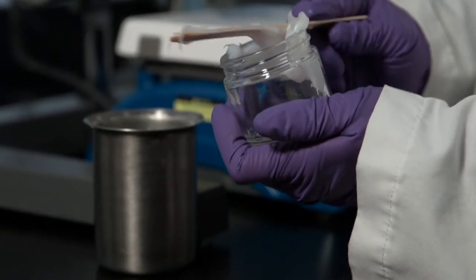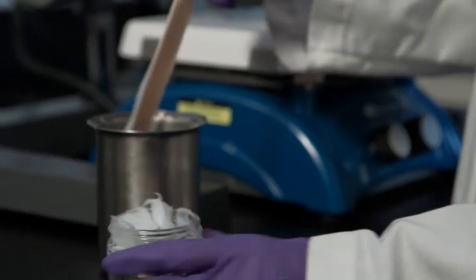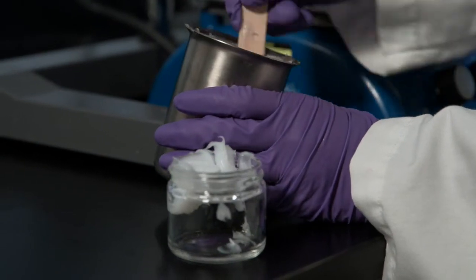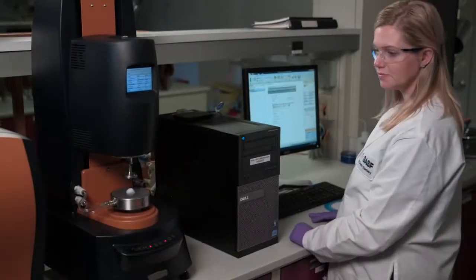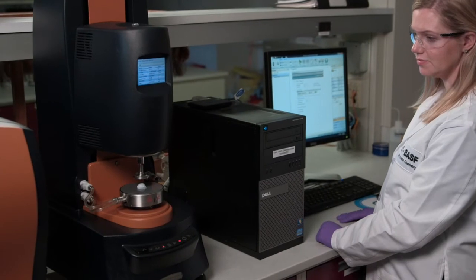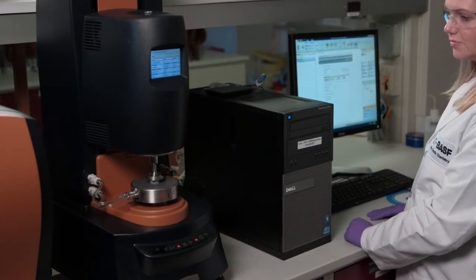The formulation should be stored for a minimum of 48 hours prior to analysis. Rheological evaluation is an essential part of any formulation. As mentioned earlier, the selection of excipients, compositional values, and processing may all influence the rheology of a formulation.